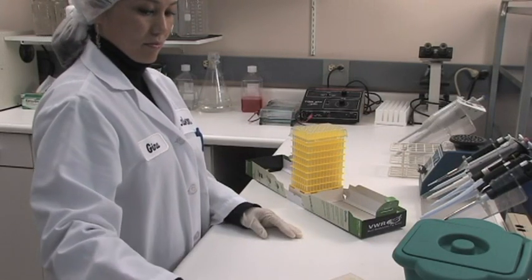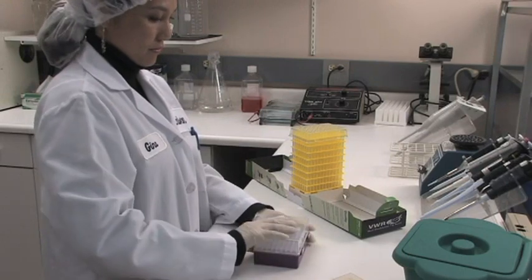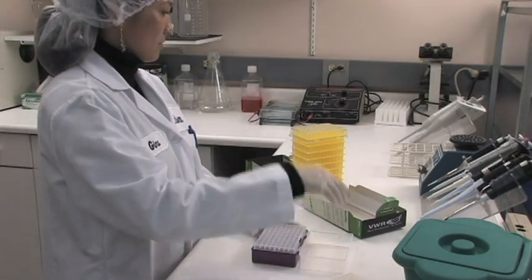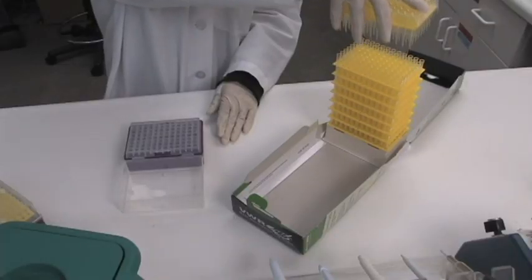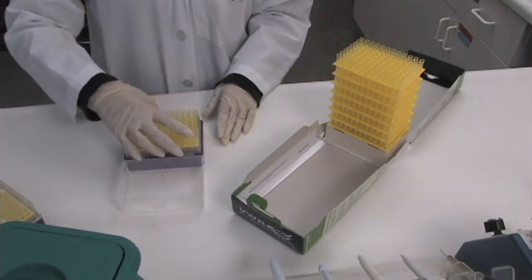Unlike other reload systems, the clear transfer cover keeps tips clean even without using gloves and the next generation package is very stable on your benchtop.